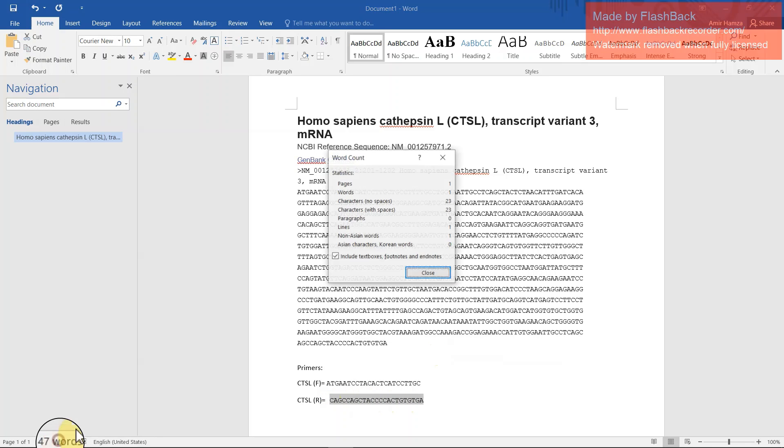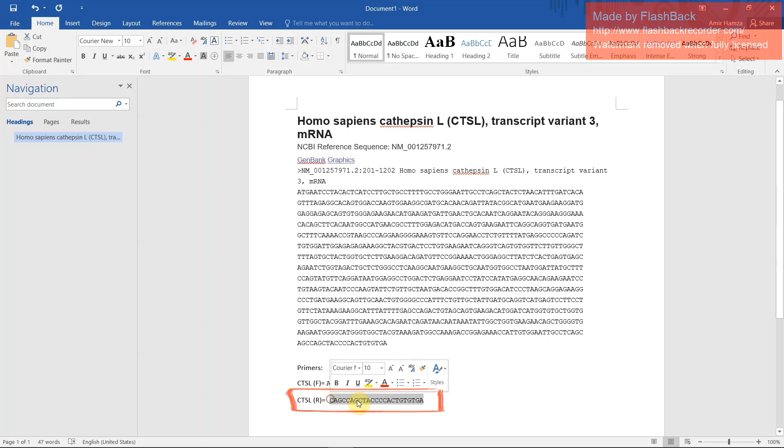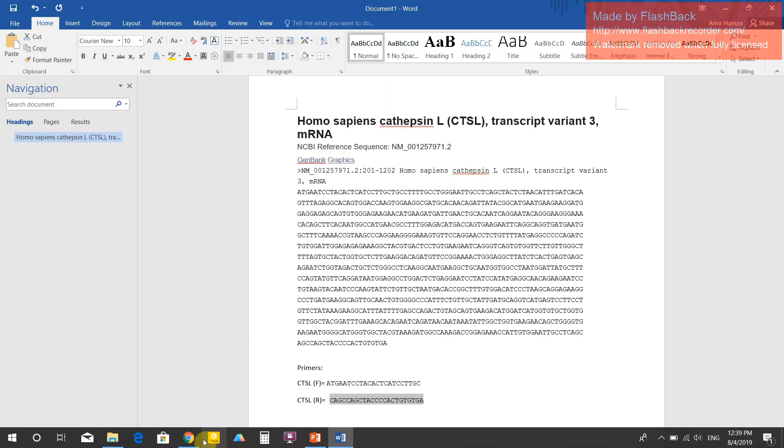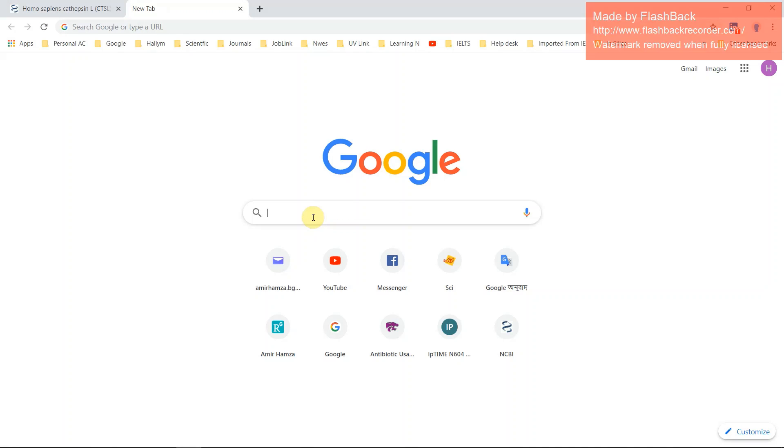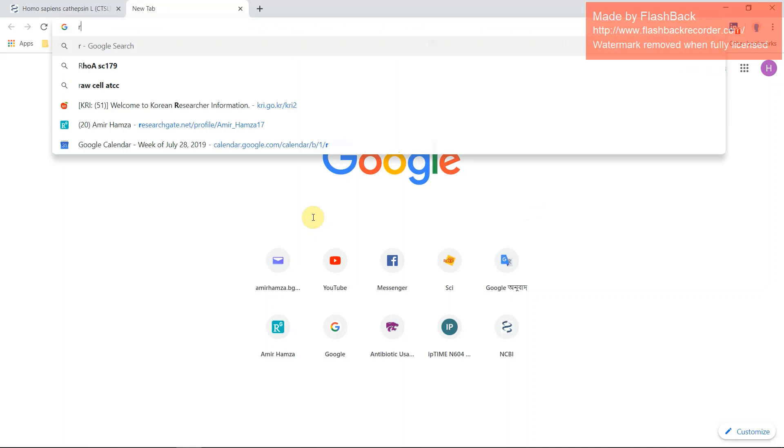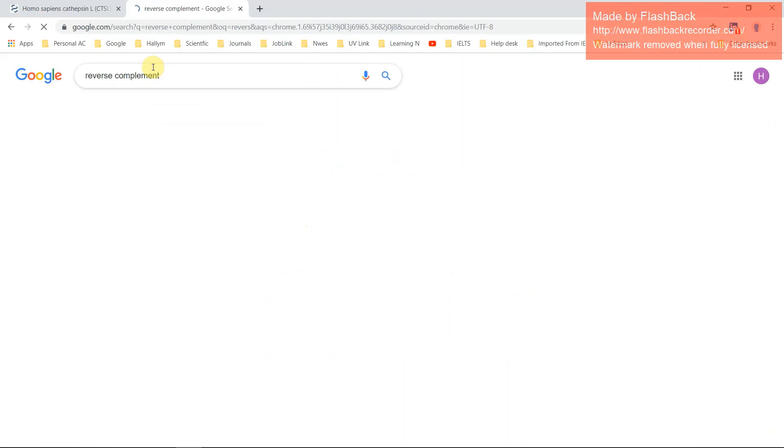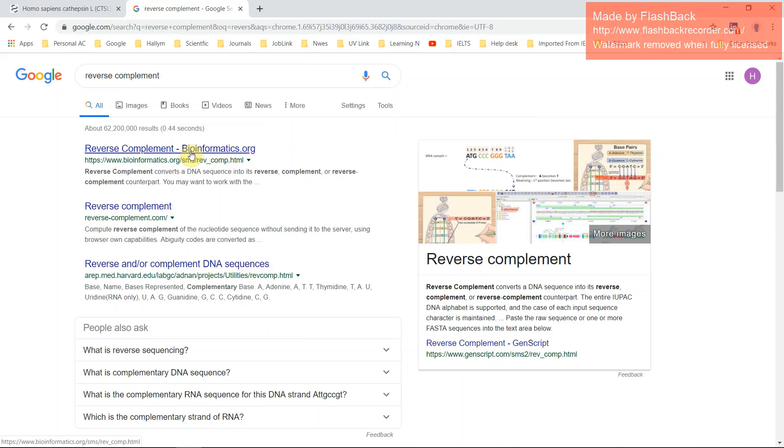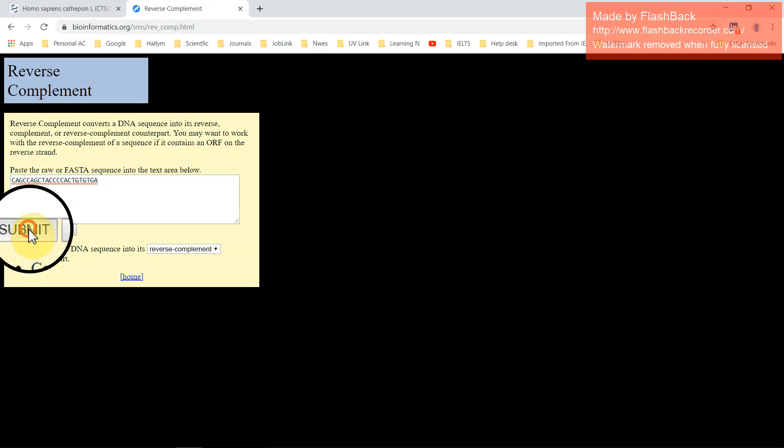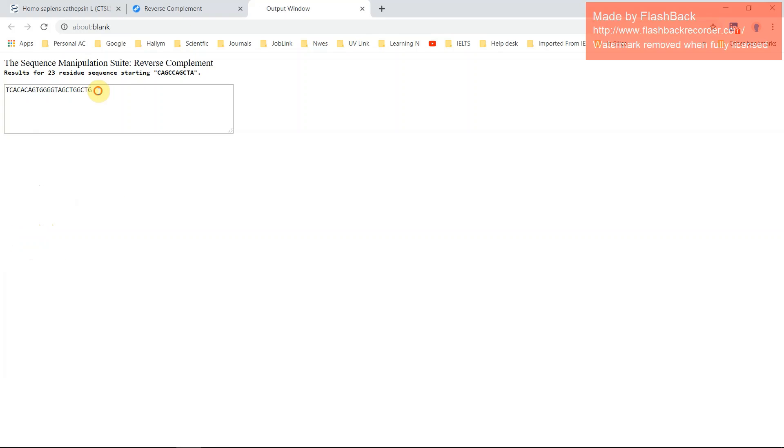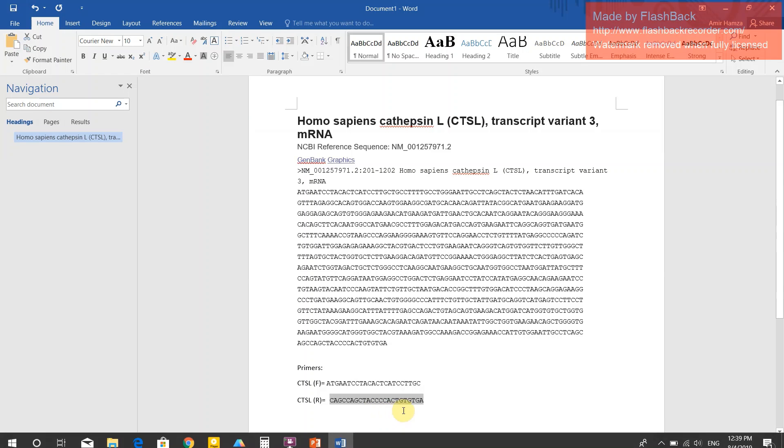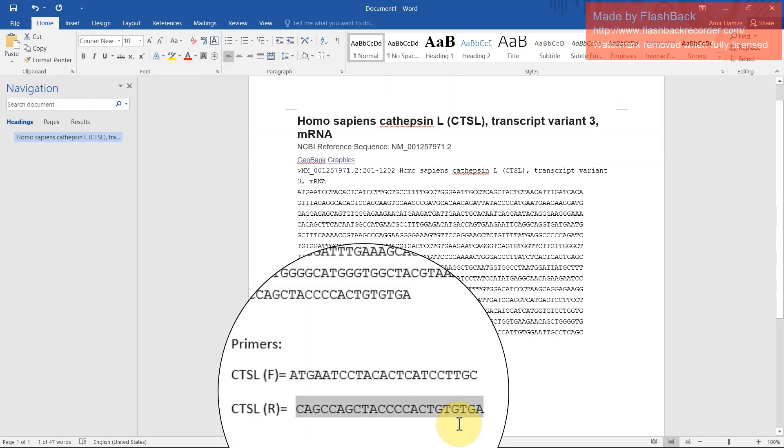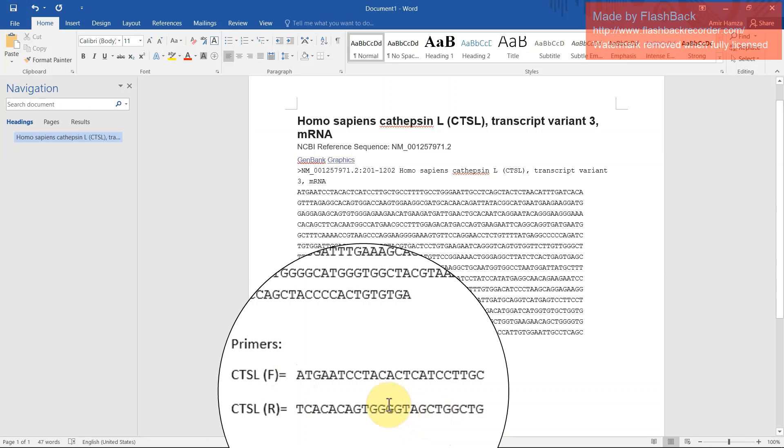Total 23 and it also contains C. But in case of reverse primer, you have to make it reverse complement. Copy and go to Google and search reverse complement. First one, click here, paste your sequence, submit and it will result. Just copy and paste here. This is your reverse primer.